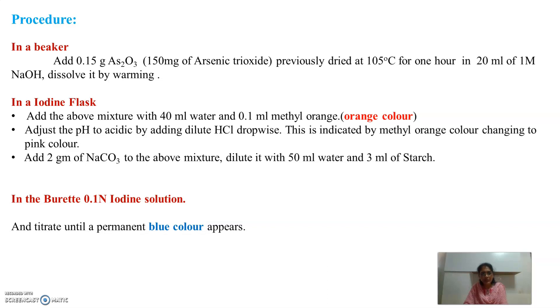Once the pink color appears, add 2 grams of sodium carbonate to the above mixture and dilute again with 50 ml of water. Add 3 ml of starch solution and immediately titrate with the 0.1 N iodine solution until a permanent blue color appears. Note the burette reading.